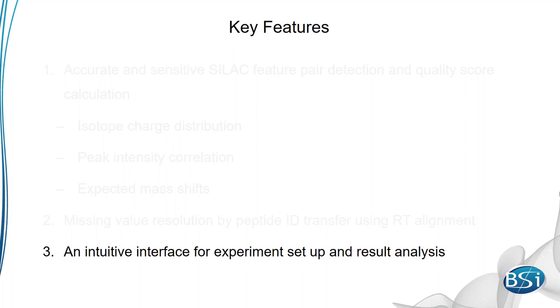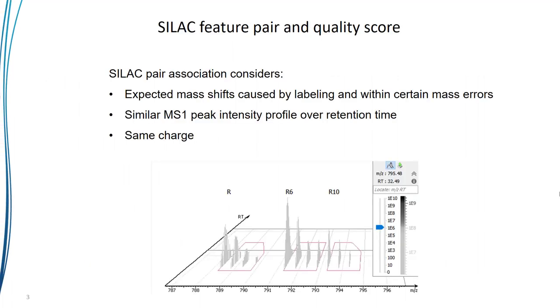I'll take you through a quantification project in PEAKS to show how to set up and interpret a SILAC project. First, let's take a look at how PEAKS accurately predicts SILAC feature groups. There are certain characteristics you can use to distinguish SILAC feature groups from the rest of the LC-MS data.